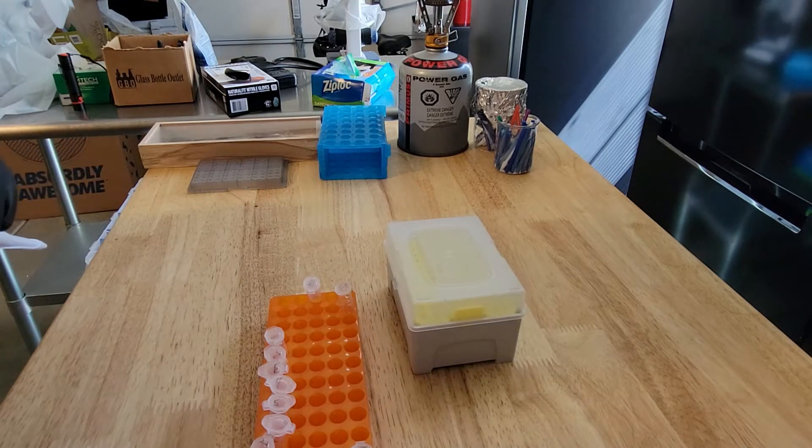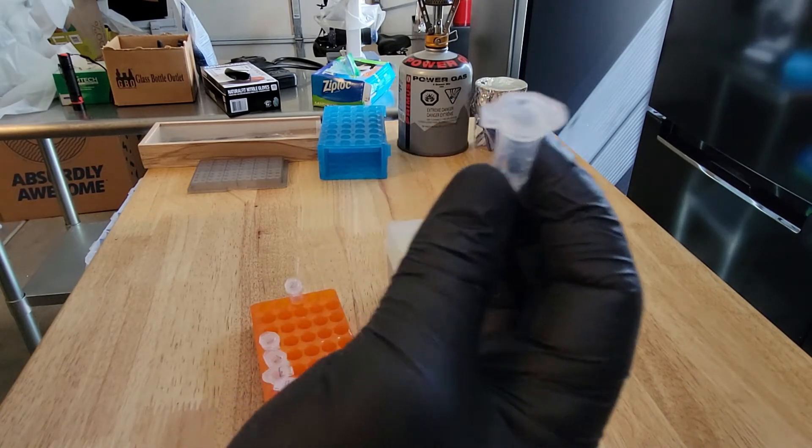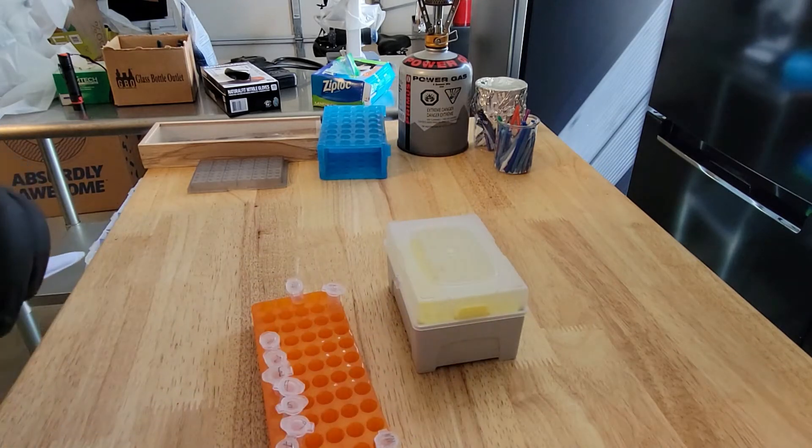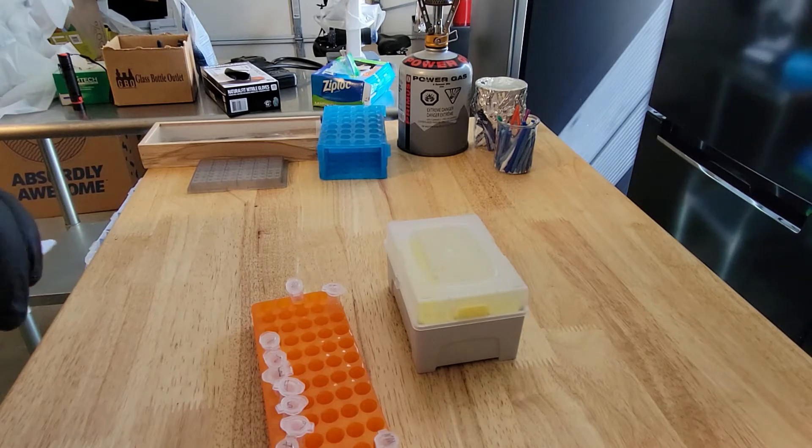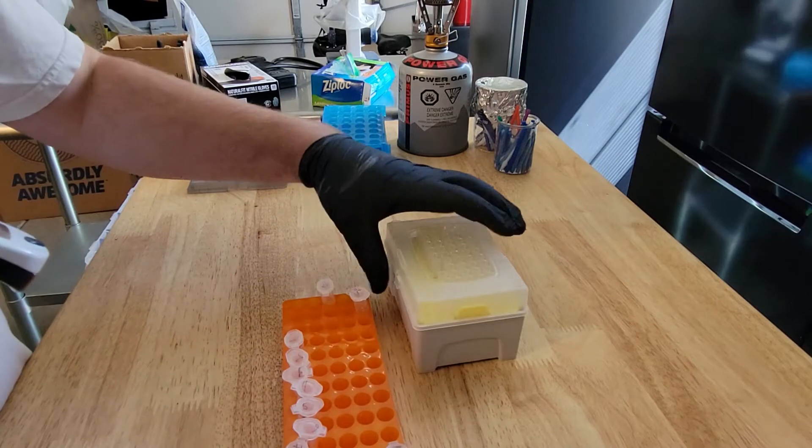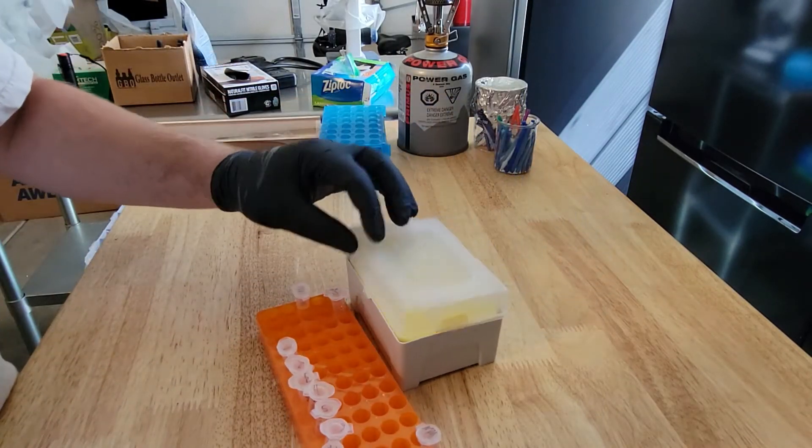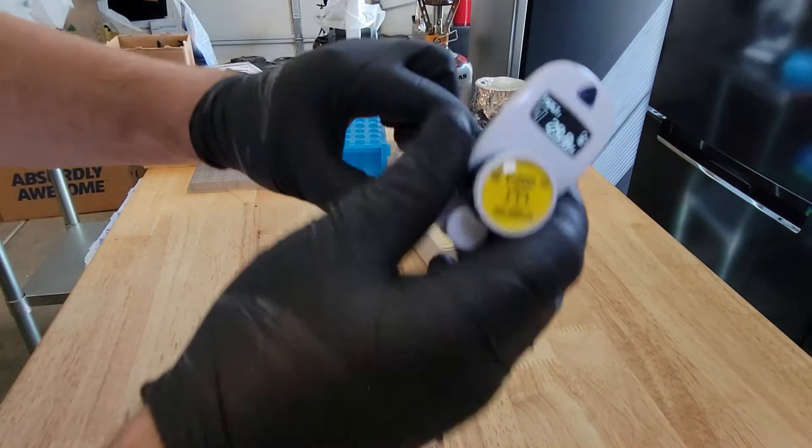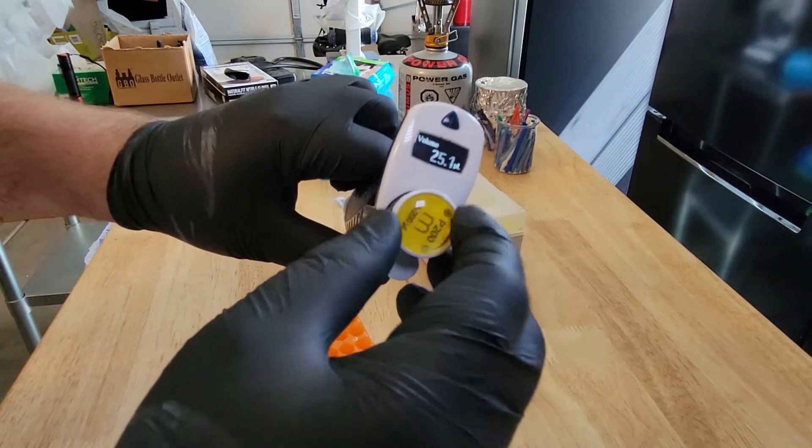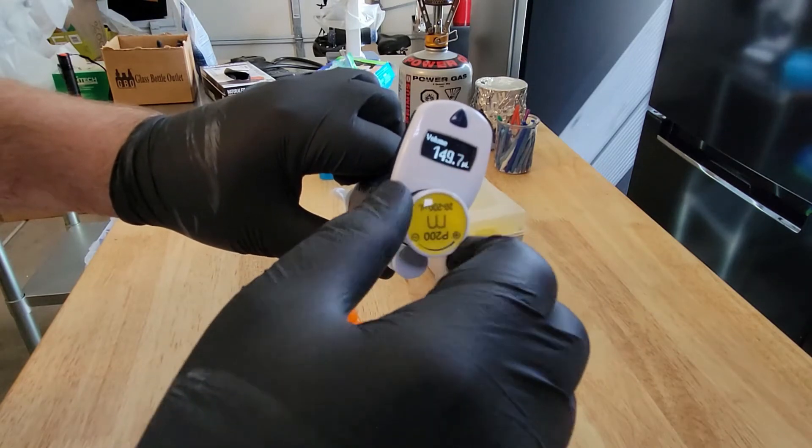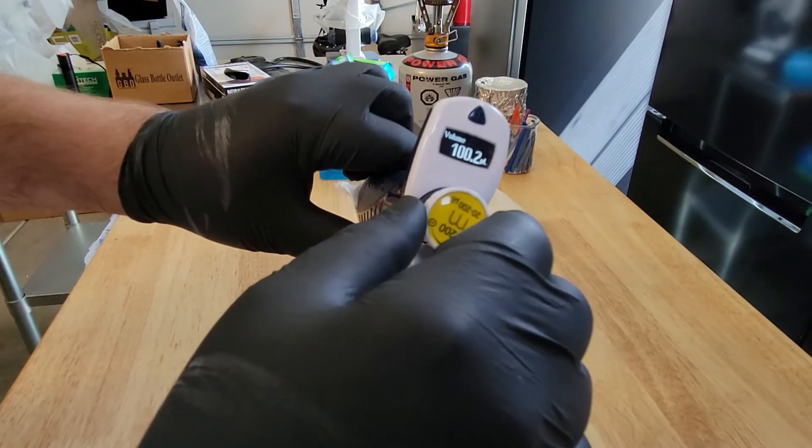Before we do our mushroom extraction, we're going to add our extraction buffer to all the microcentrifuge tubes. This extraction buffer is made from tris and some potassium hydroxide and a couple of other chemicals. That's going to allow us to open up the nuclear envelope and get DNA out of the nucleus and also rupture the cell wall of the fungus. I'm going to take my micropipette. I got this one for free. These would normally be pretty expensive. We're going to change the volume to 100 microliters.